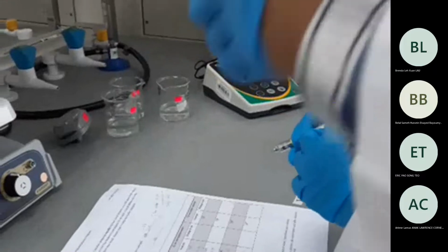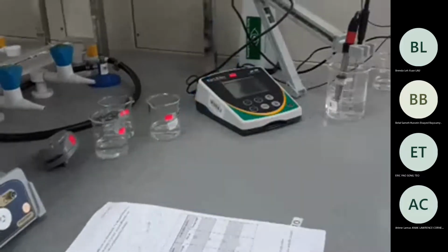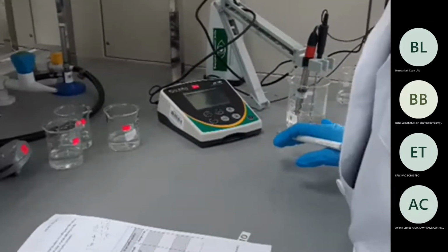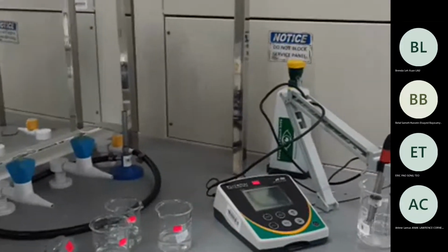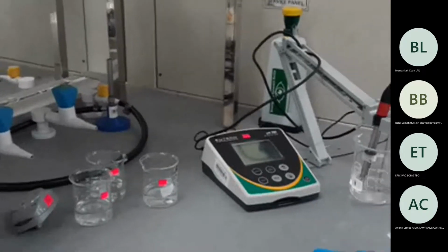What do I do first? Yeah, you need to record here. This is the buffer. So you have to record it here. Later the buffer solution we need to divide into 4 beakers, 25 milliliters each.